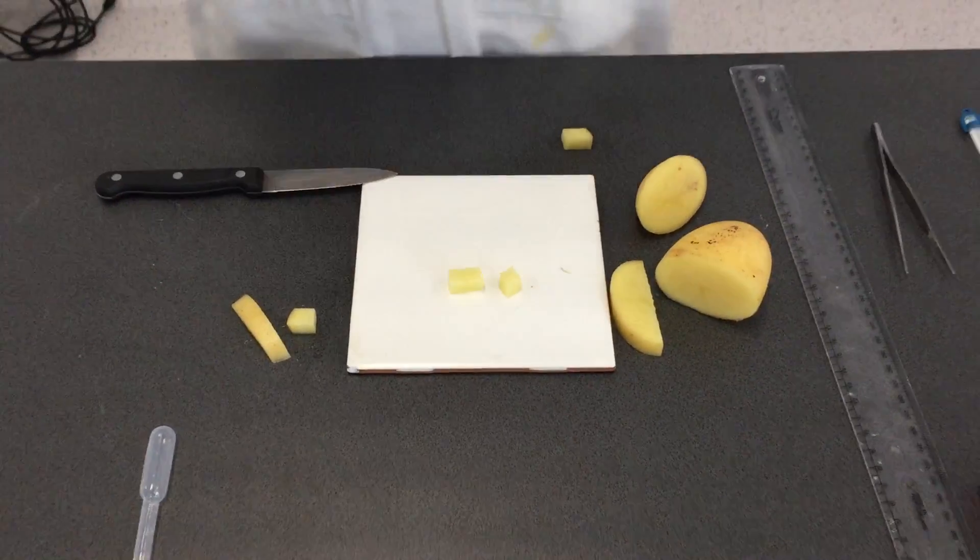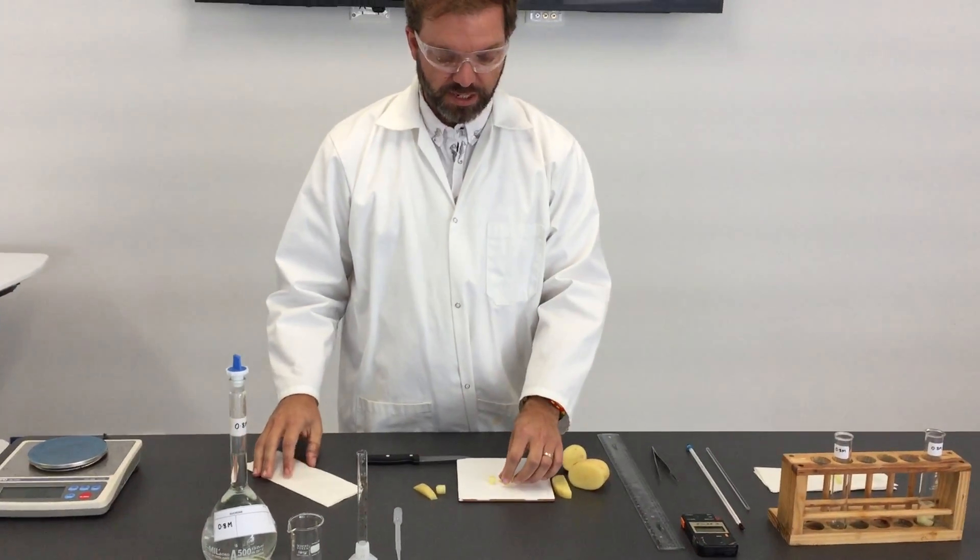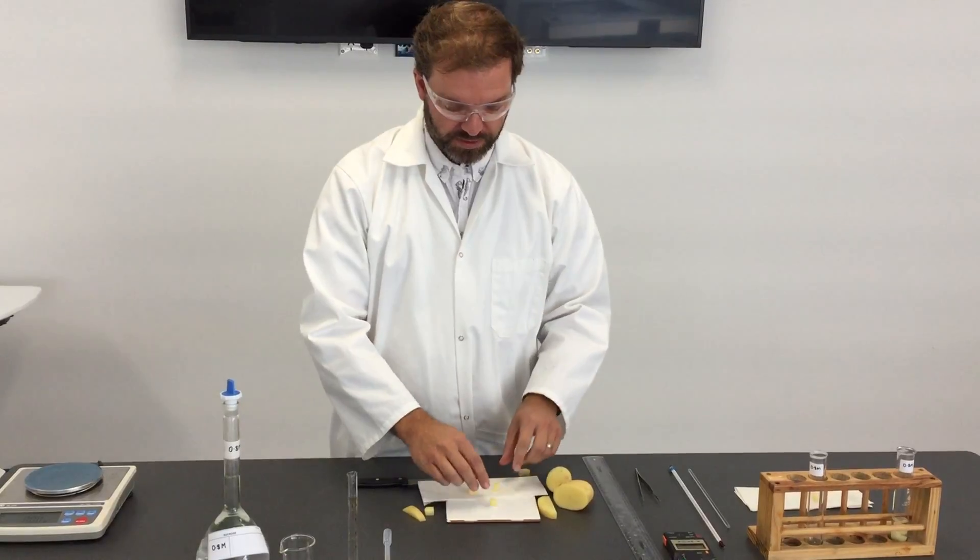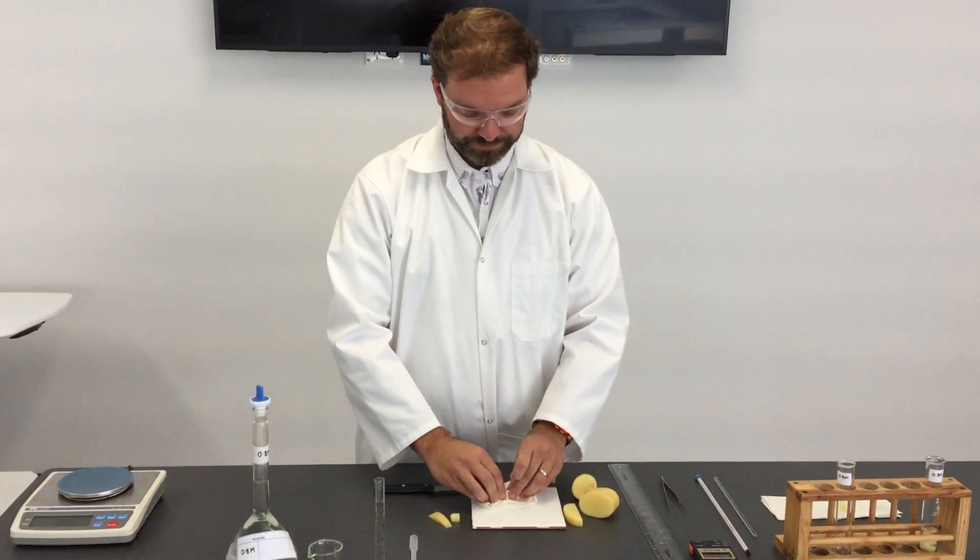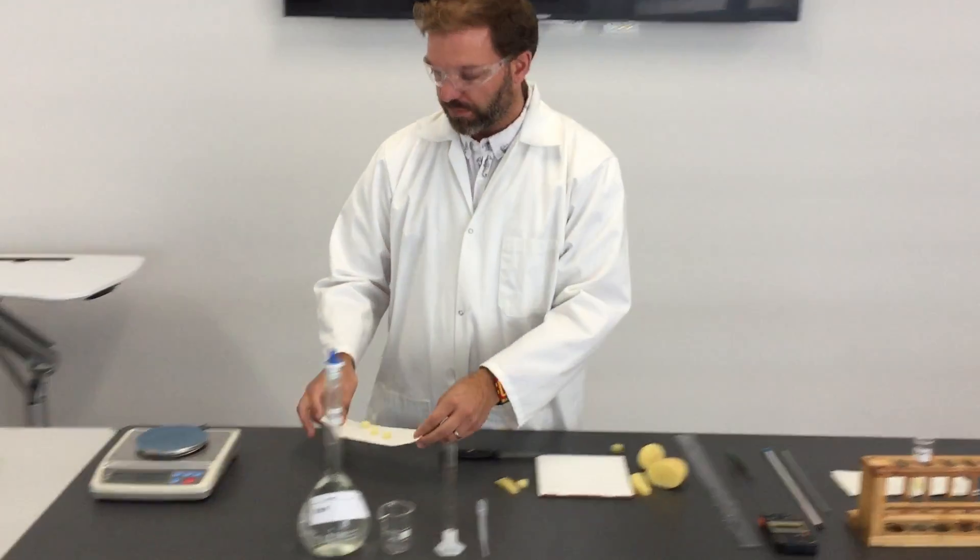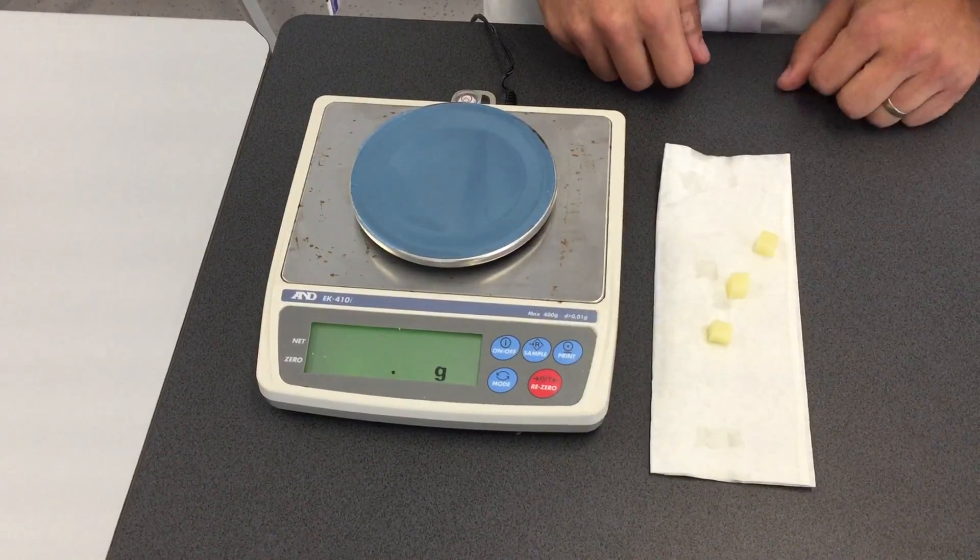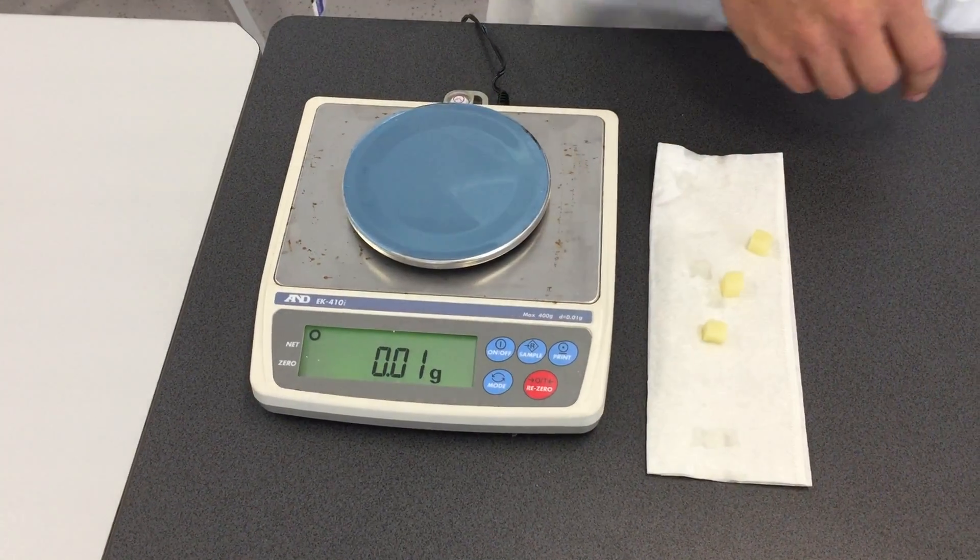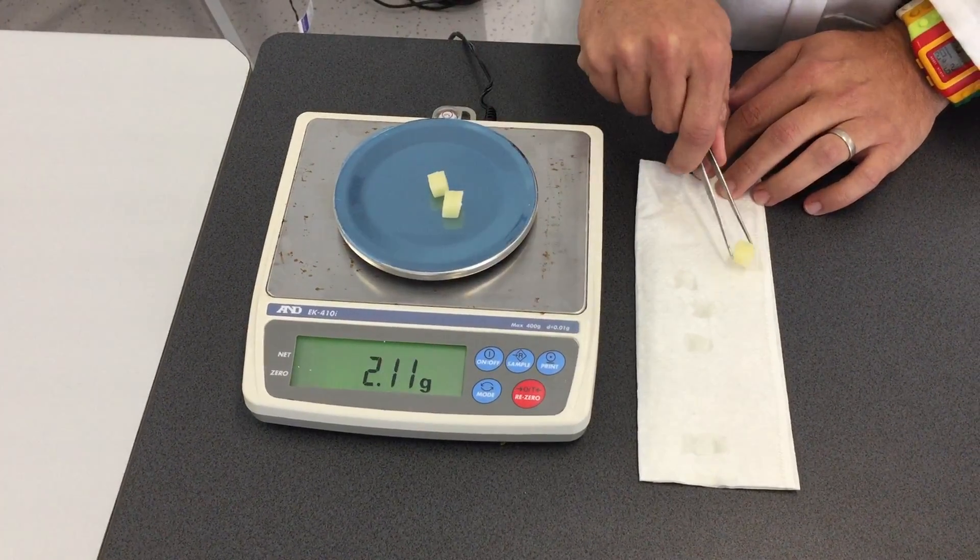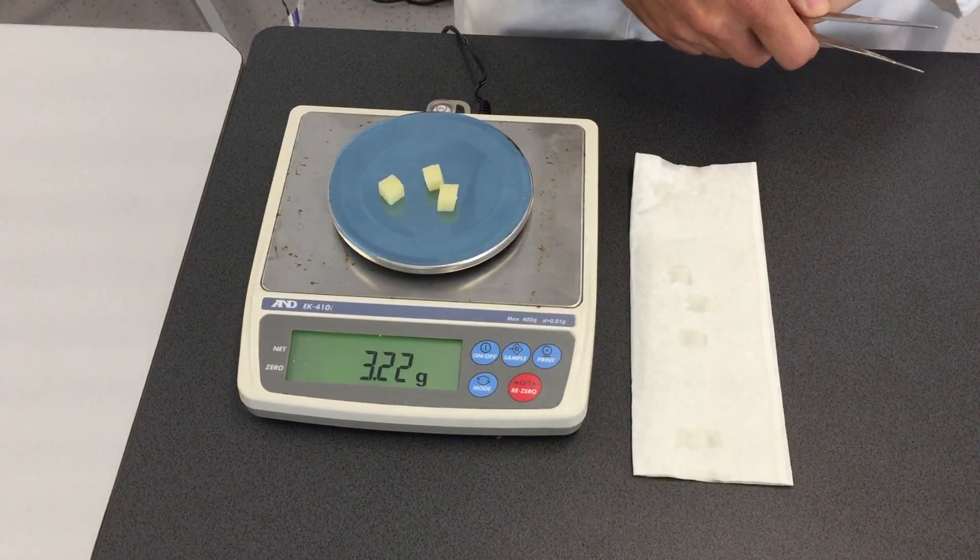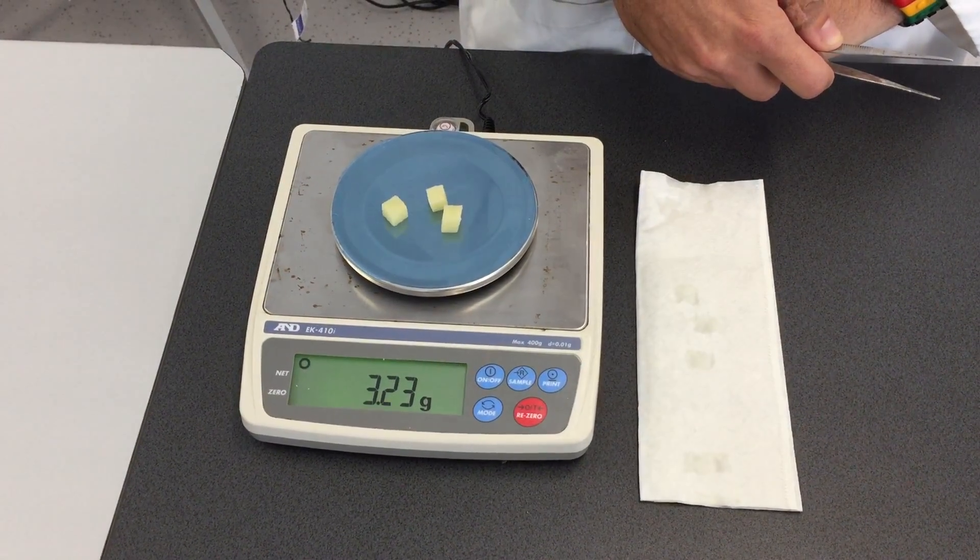Because we're looking at the change in mass in these, we need to weigh them first. But we want to make sure that the outside is dry, so the wetness on the outside doesn't add to the mass. We'll just pat them dry. And then on the scale here, checking that it's been zeroed, we can then place those pieces on there. Wait for that to settle and then record the mass: 3.23 grams.